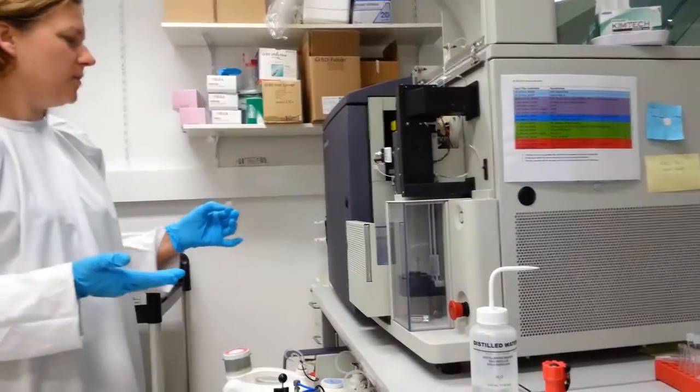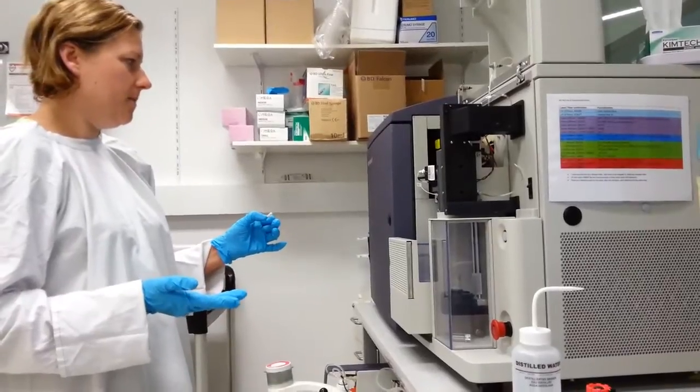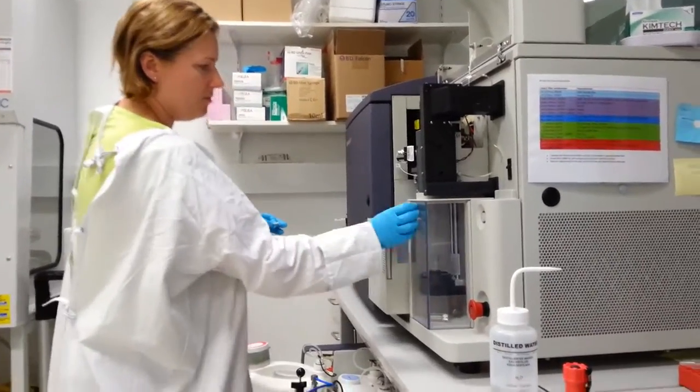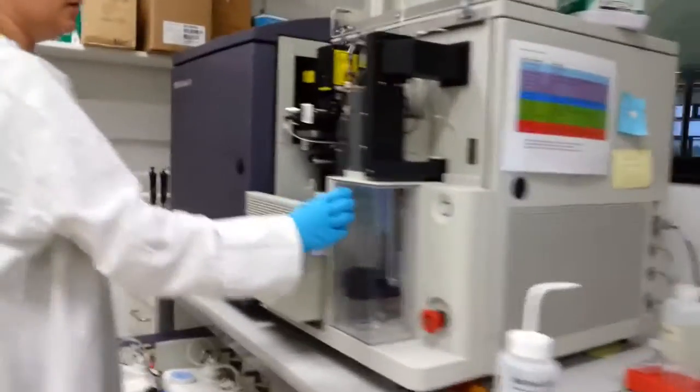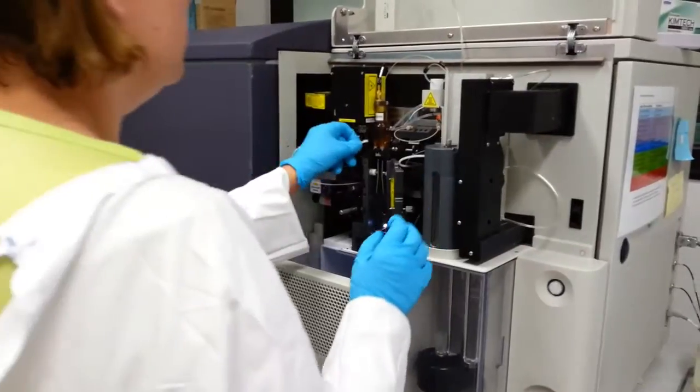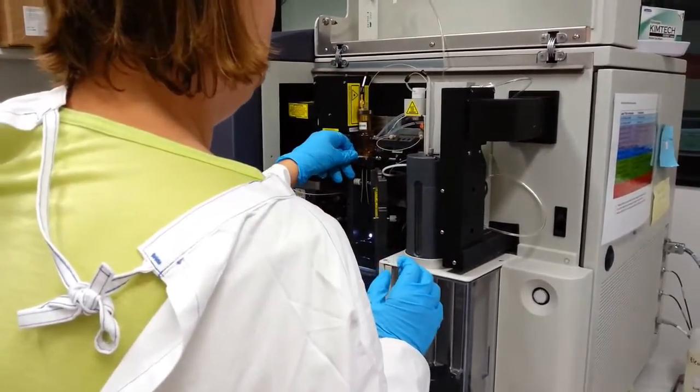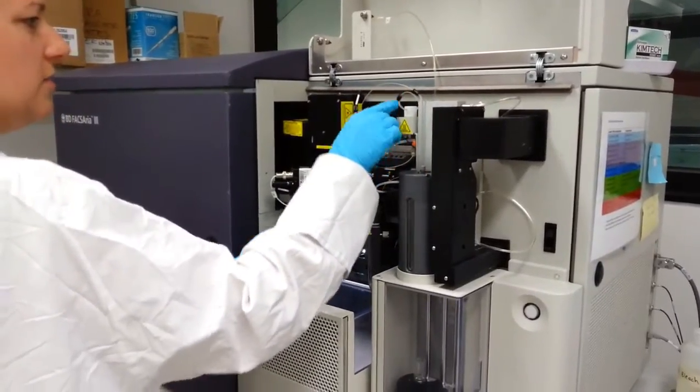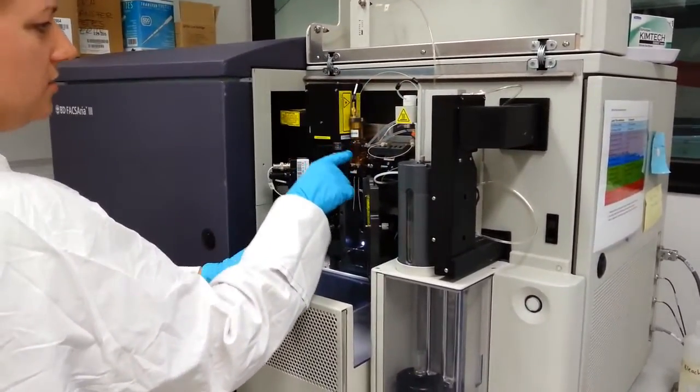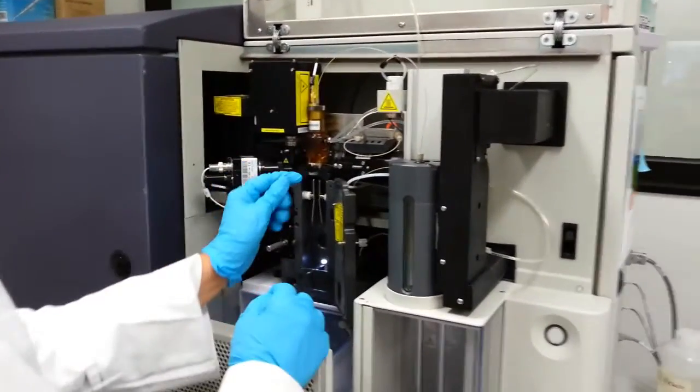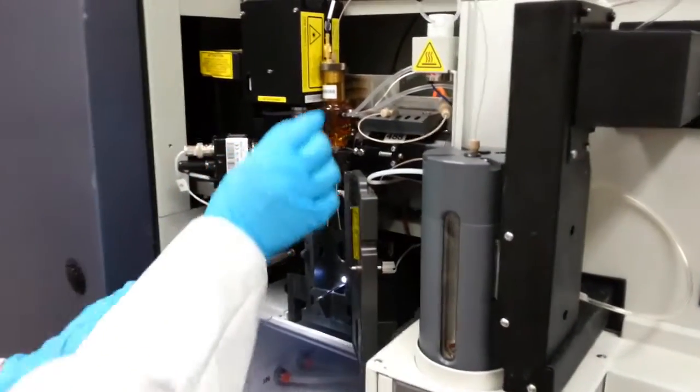This machine works by a sample of mixed cells coming up here into the sample chamber. This gets pressurized, and then when I hit run, the cells travel up these tiny tubes into this, what's called a flow cell. And in here, there's two chambers.